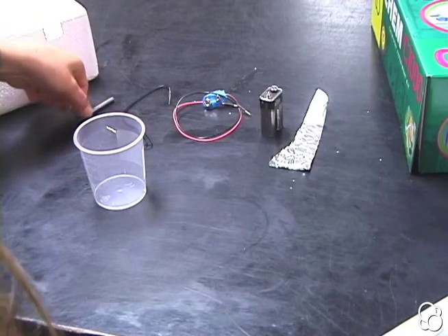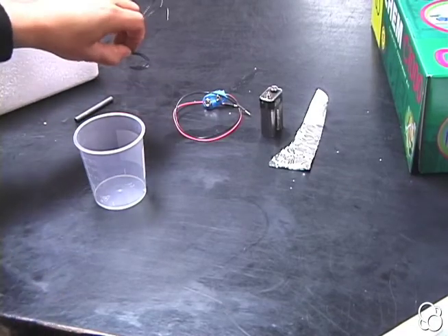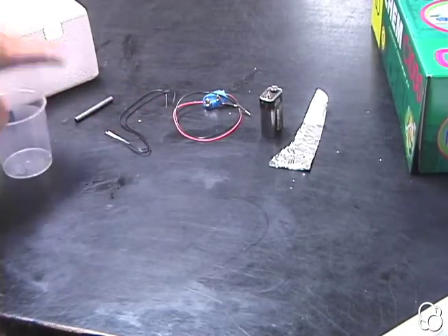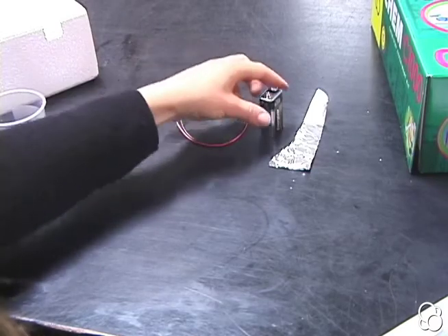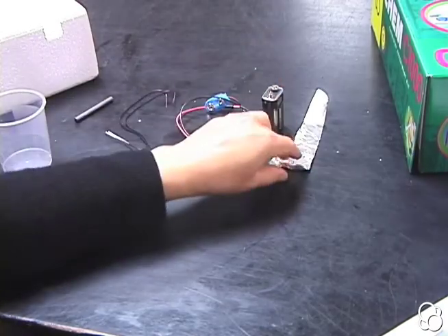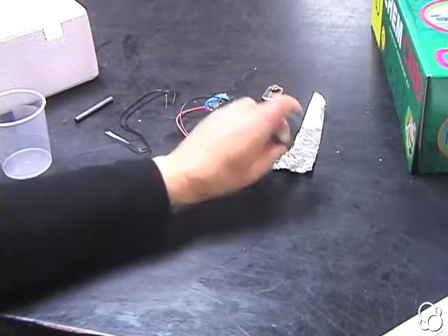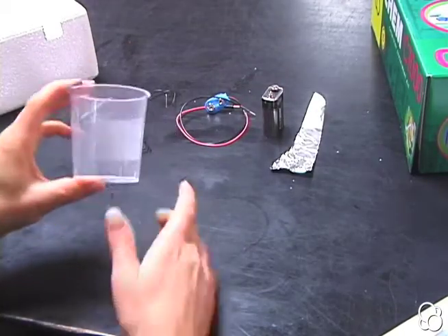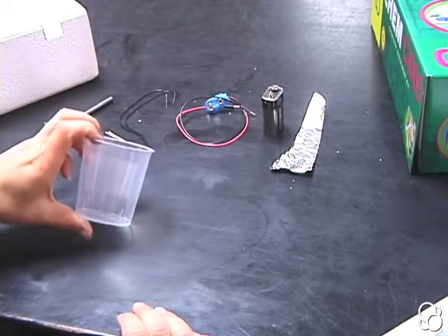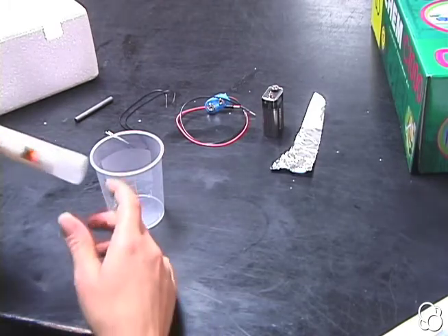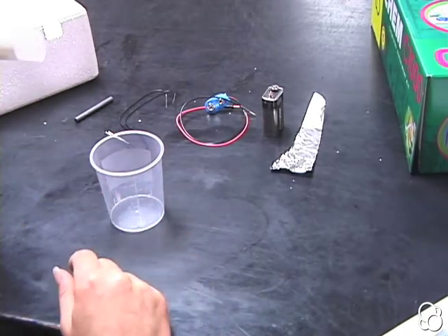You're going to need your carbon rod, these two wires, your battery clip, a battery, a piece of aluminum foil, one of these cups with some water, and some sodium carbonate to make a salt solution.